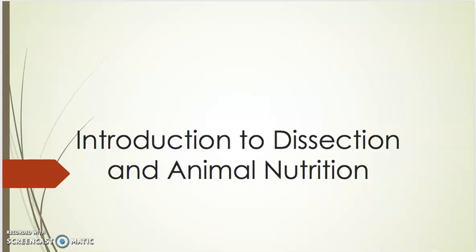Hi everyone, your lab this week is Introduction to Dissection and Animal Nutrition. This should be telling you that you're going to be concentrating on the digestive tract of this mammal and looking into that very specifically. And you will also cover some of the other systems as well. That is part of respecting the fetal pig that you have there.